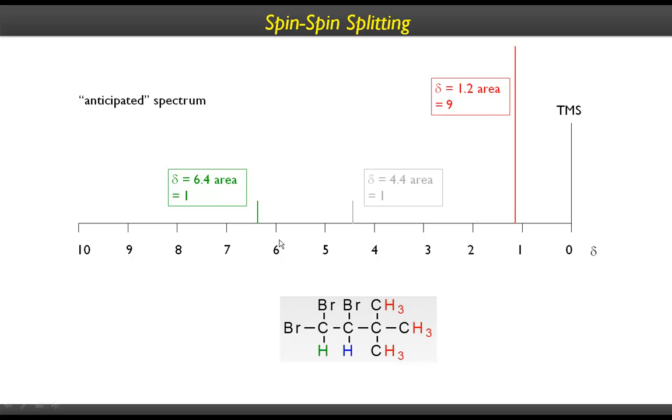That's the reason why it has a higher chemical shift. In olden days, the field was changed and the radio frequency, the electromagnetic radiation, was kept constant, so this terminology is kind of paradoxical, counterintuitive, to call a higher frequency a lower field, but anyhow, that's not the case these days.